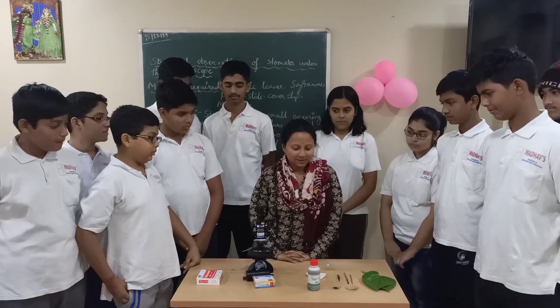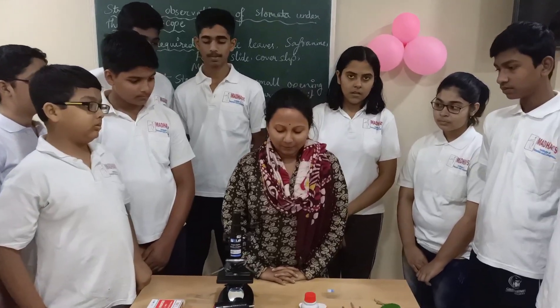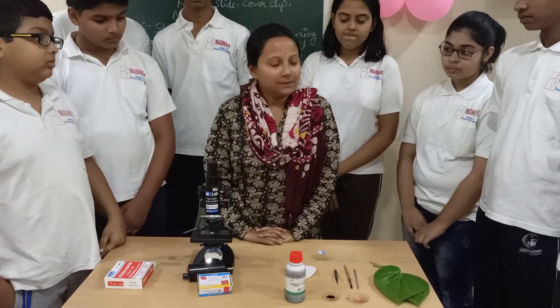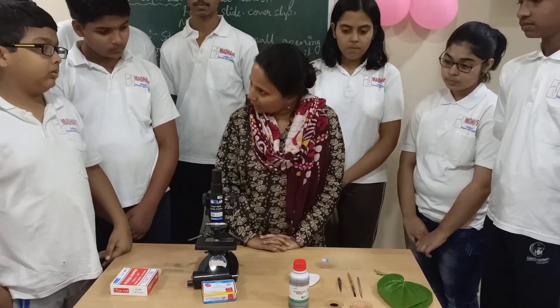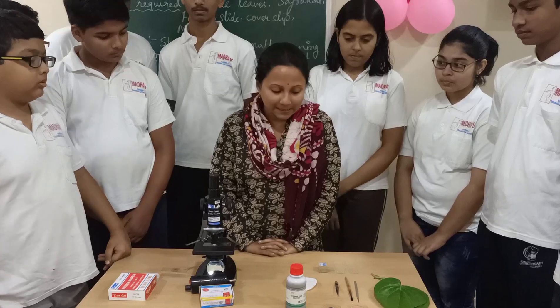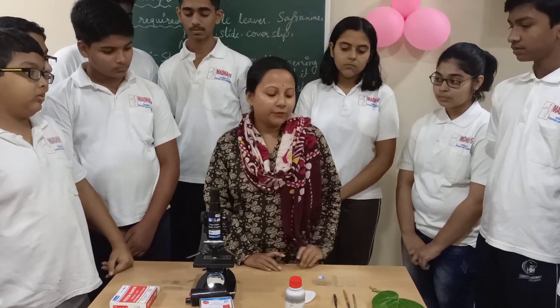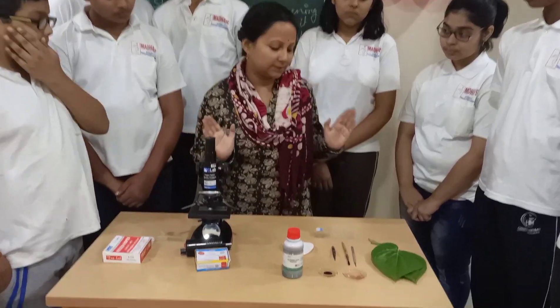Good morning students. Today we are going to conduct a microscopic observation of stomatal cells. We will observe the structure of stomata or stomatal cells under the microscope. For this activity we are using some materials — let me introduce you to them.